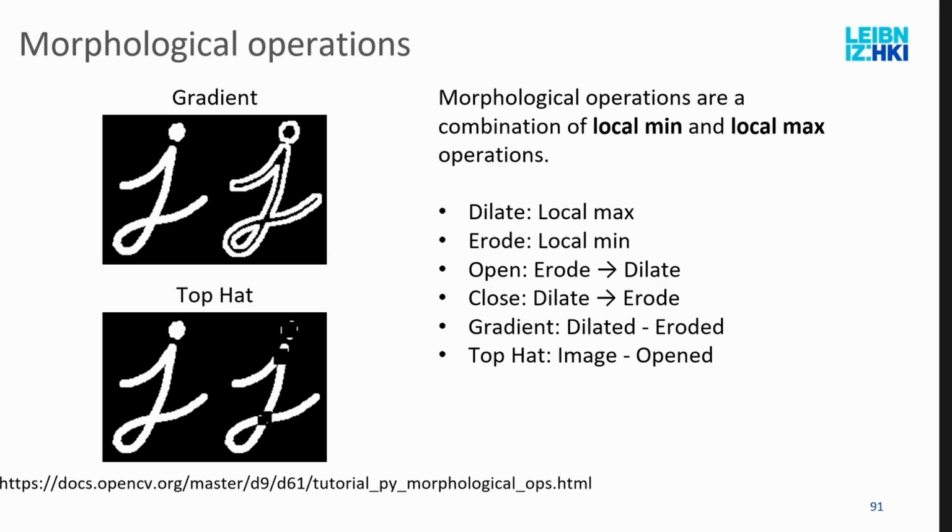They rather give in textbooks a set-based definition, so mathematical sets, or something that is binary, but this falls apart for top hat. But you have seen how top hat works when you just see, okay, it's a local minimum and maximum. It will enhance these block-like and ridge-like structures in the images and suppress all backgrounds around it.